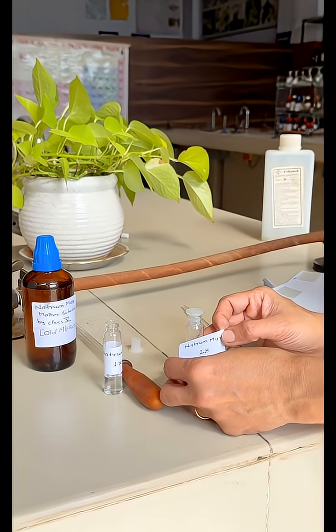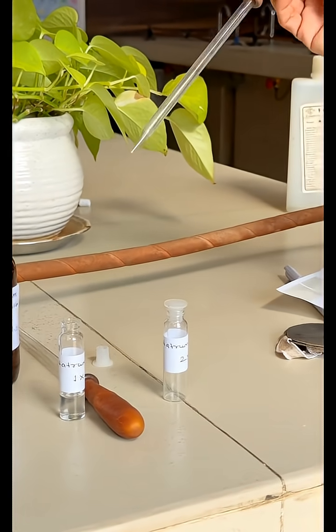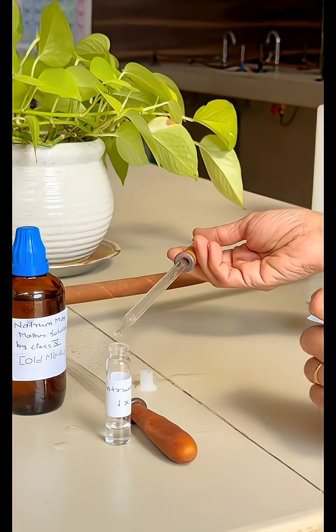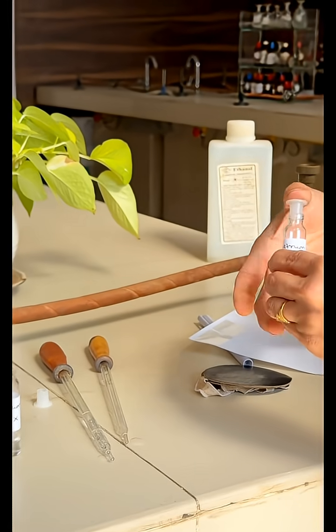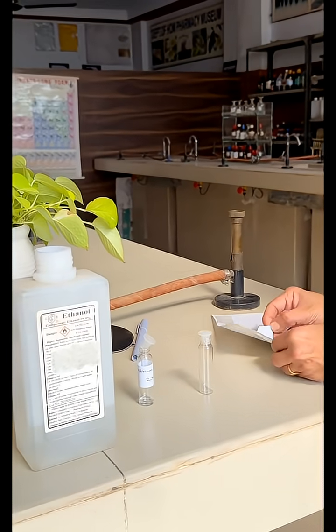For preparing 2x potency, label a clean glass vial with Natrum Mur 2x. As per the ratio of the decimal scale, take 1 drop of Natrum Mur mother solution (1x) and add 9 drops of distilled water into that clean glass vial. Now cork the vial and give 10 downward strokes on the succussion pad. These strokes should be powerful, successive, and each stroke ending in a jerk. So here, Natrum Mur 2x is ready.